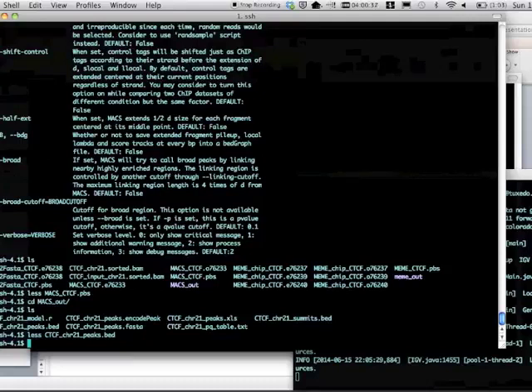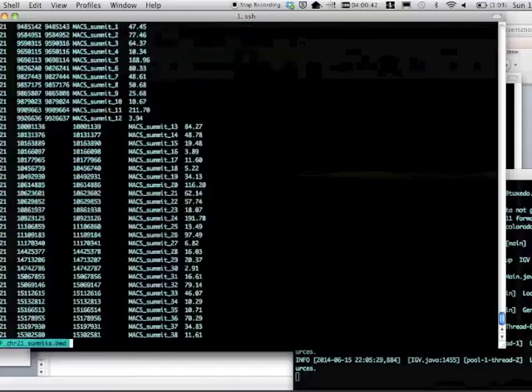The summits file is really similar to that. So instead of peaks, we put in summits. It's basically the same layout, except this is giving the location of the summit of that peak. And as you can see, if you look here, this is literally just one base pair. It starts at 38 and ends at 39. So it's just giving you the one base pair summit.